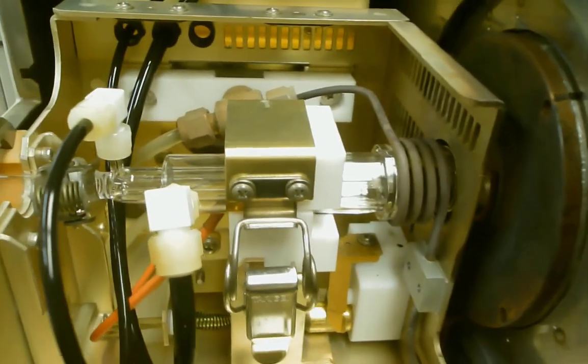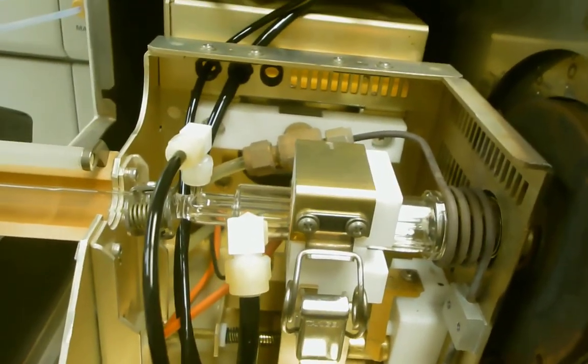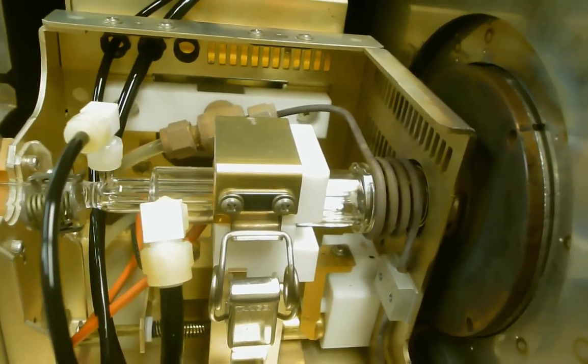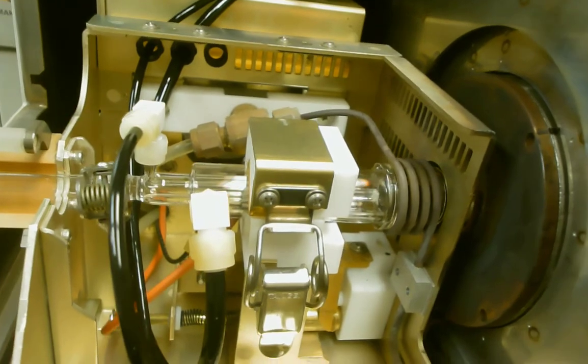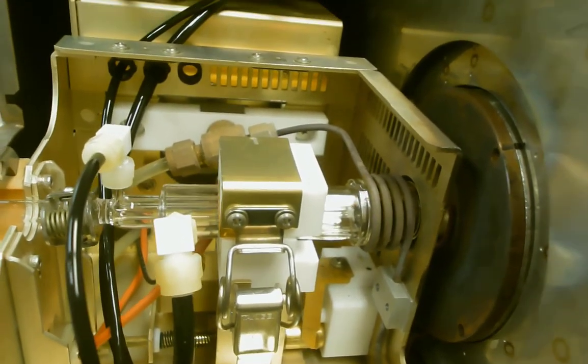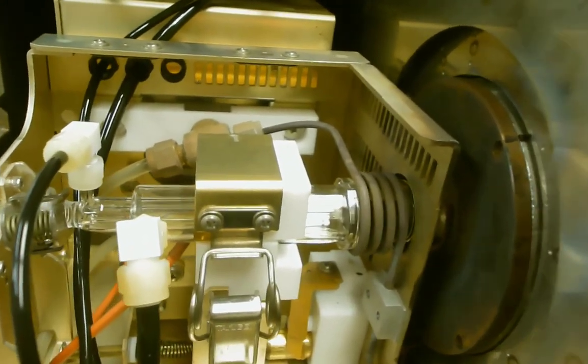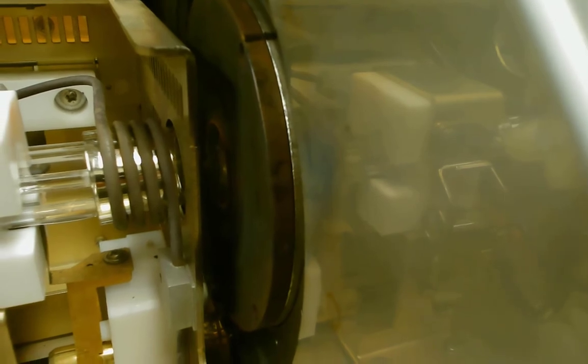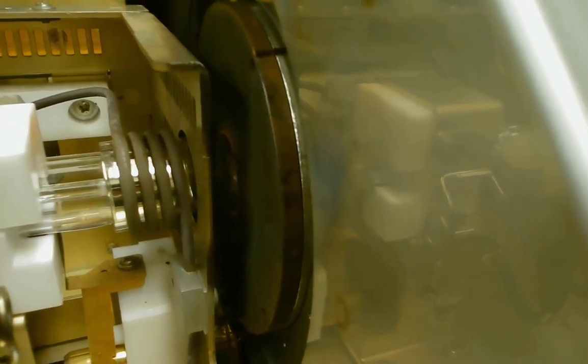And so your sample stream, whether it be from the laser using the helium carrier gas to carry the sample, or from the liquids where it nebulizes it into a fine mist and then is carried by argon into the plasma torch, they're all ionized. And then it goes here into the sampling cone, which is the interface to the vacuum.